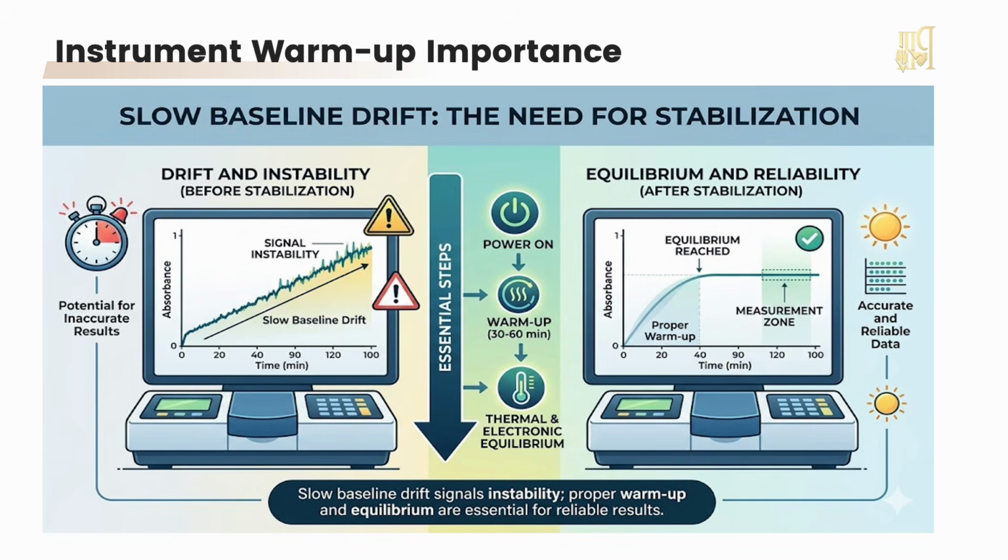So what should you do instead? Allow proper warm up. Let the system reach equilibrium. Observe until the baseline stabilizes. Because if your starting point is unstable, your result will never be reliable.